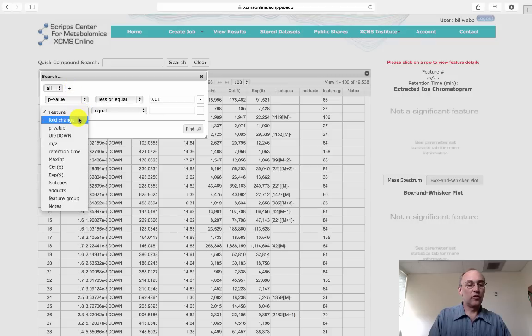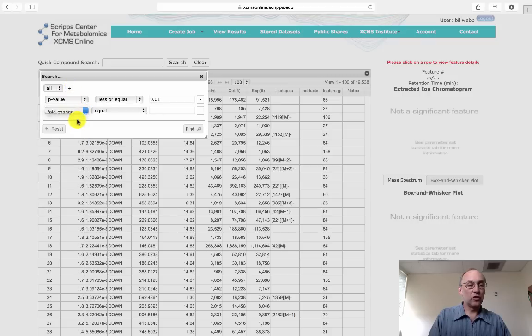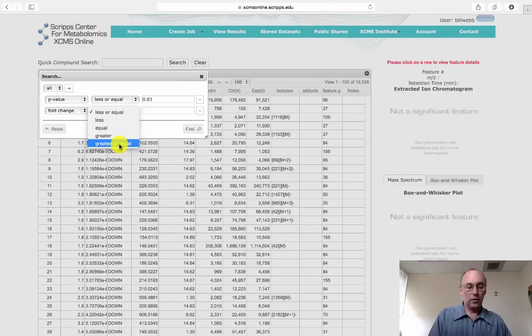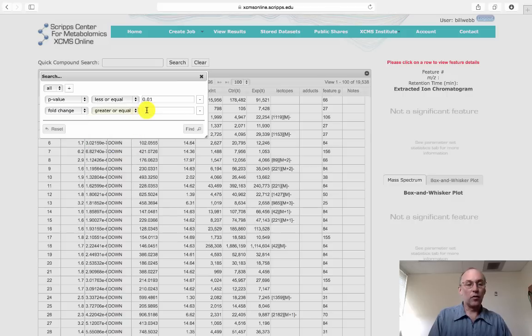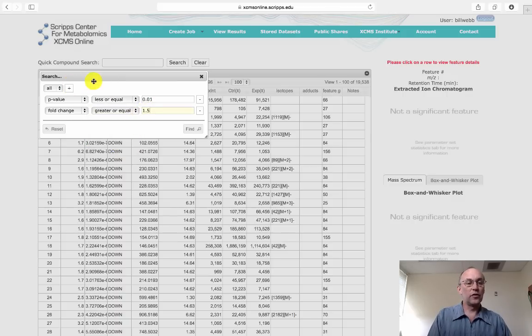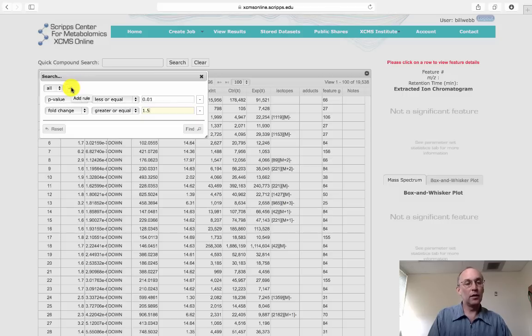The next parameter we choose is fold change. And here, a value of 1.5 or greater is a good starting point. Only features that differ by 1.5 or more will be displayed.